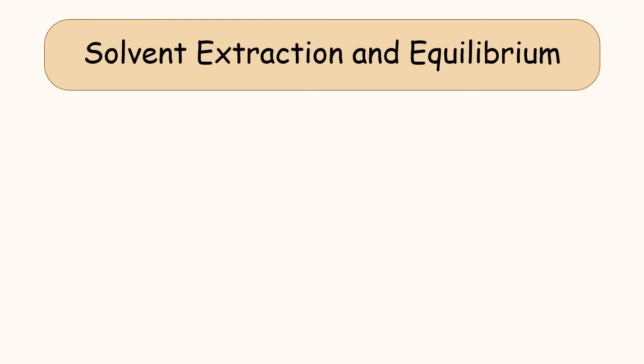Now, solvent extraction, remember in the picture when we did it at the start, we saw that some compound went into the new solvent and some compound stayed in the original solvent. That is because solvent extraction involves equilibrium.